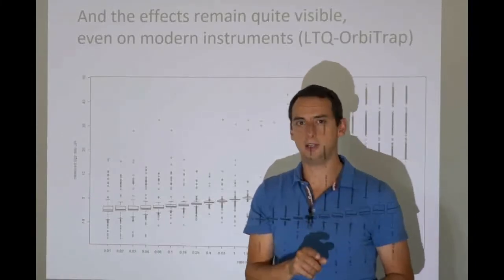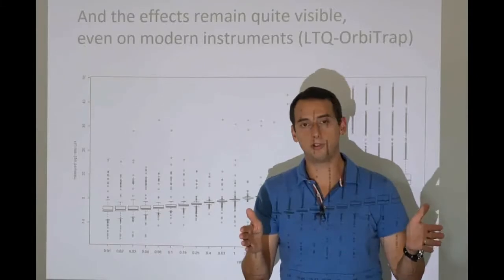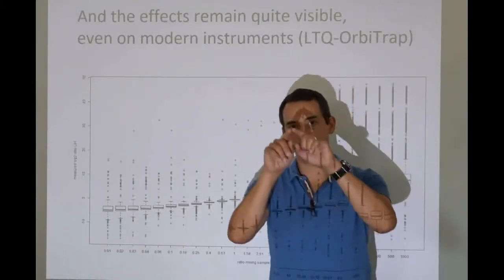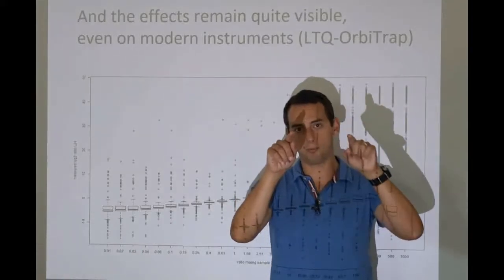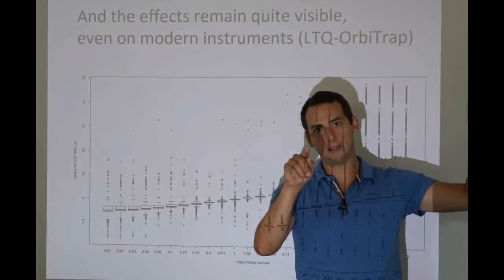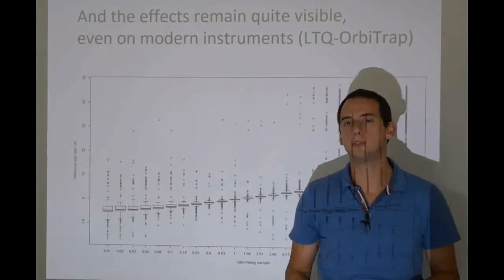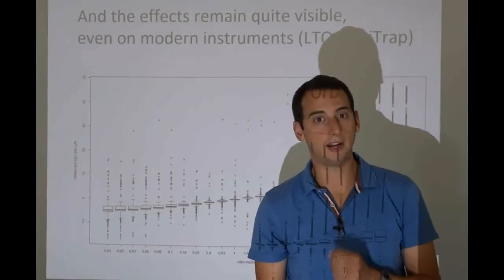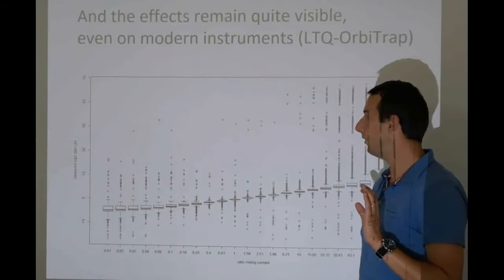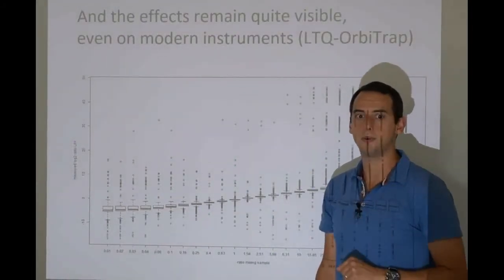So if you study, say, a standard sample that is being run for quality control over time in a mass spectrometer, and you look at the signal, you will see a deterioration that is compensated, and then at some point you will see a spike. And that spike is usually the new detector. But you will see this fluctuation, and something to keep in mind: detectors are not inherently stable either. Okay? So these two things I think are very important if you want to do quantification, because they affect what your result will be.